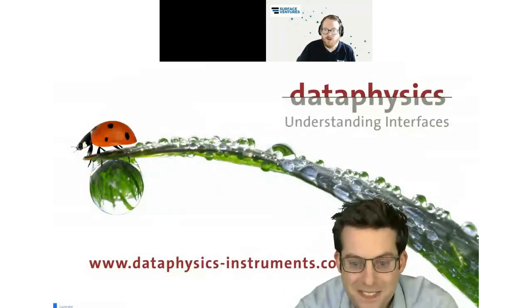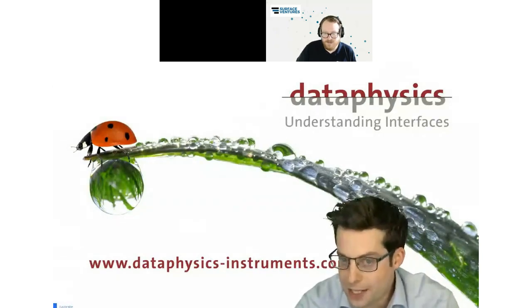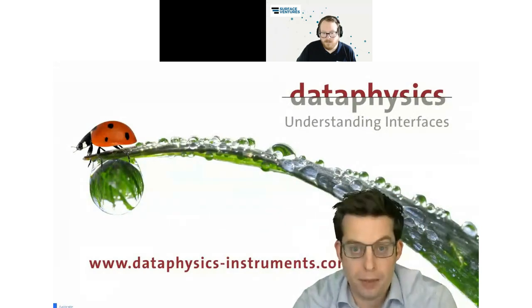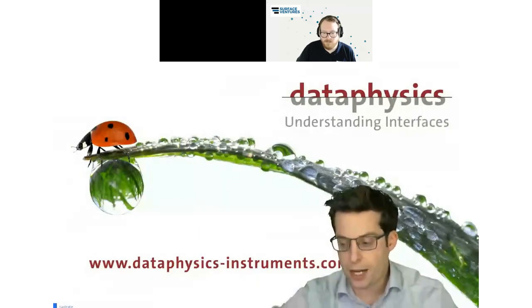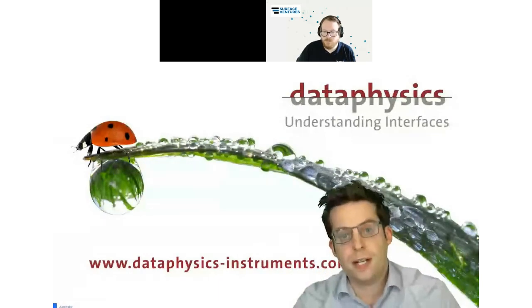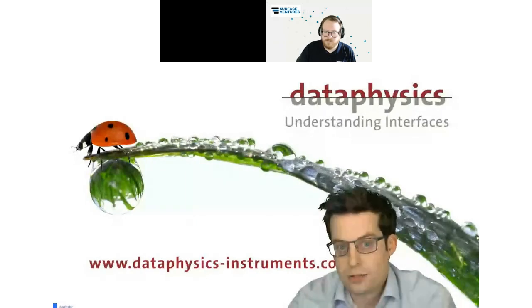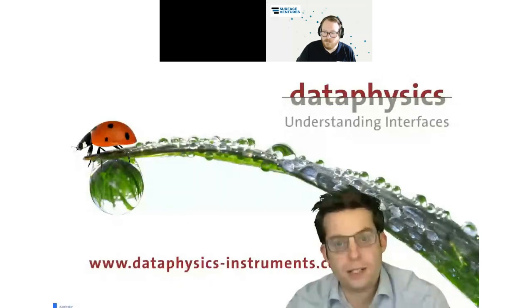Brilliant. I had a question there. What do you mean by classical contact angle measurement? For me, the classic one is this: a contact angle, you have a drop and there is an angle on the side. So classical contact angle measurement for me is the optical method, where you can really look at it and you do not need big software or anything. Even with your bare eye, you can see, okay, the angle there should be around 45 or 50 degrees. This is classical contact angle measurement by optical contour analysis. Here, when you look at the sample, you have no clue what the contact angle will be. This one is dynamic contact angle measurement by a tensiometer, and I would not call it a classical contact angle measurement.